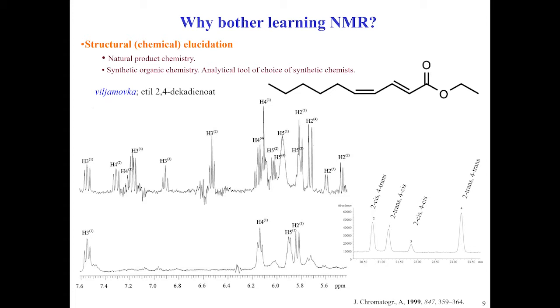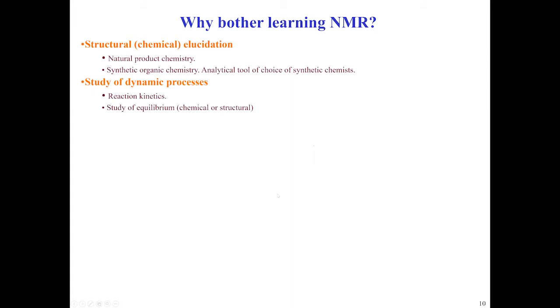This is a strong liquor, so it's like 40% of alcohol. And then the compounds you're looking at are really minor compounds. This has improved over these years, how you treat these small amounts.